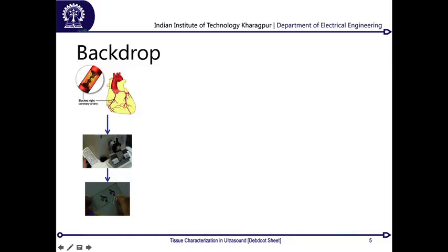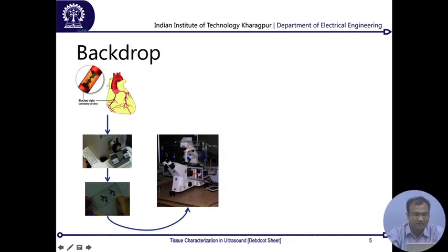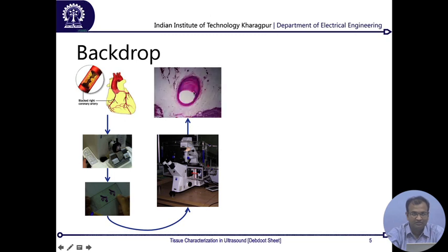Consider slicing of bread; over here it will be slicing of tissue, and we use a machine called a microtome to do that. Then you mount the slices onto a glass slide and stain them, and after that you look into the microscope, and you see something of this kind.